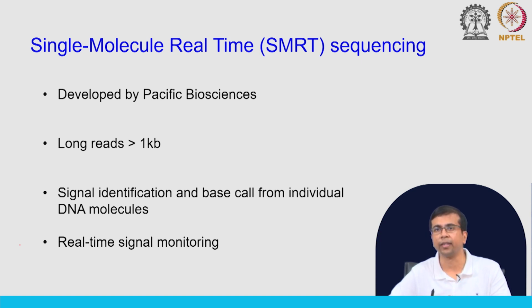We will talk about this phasing problem, pre-phasing etc. later on, and we will see that this will lead to degradation of signal. So, when you talk about quality of data, you will see this problem coming up with Illumina data especially. So, these are two advantages of this method along with the long read that we get.